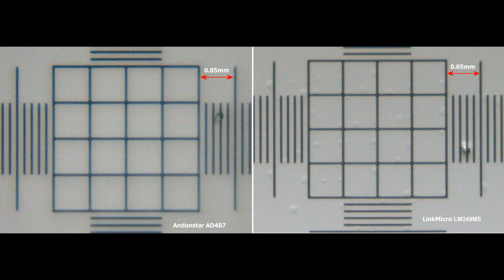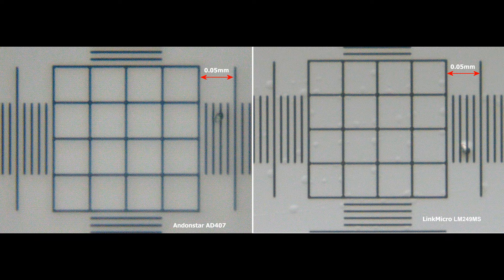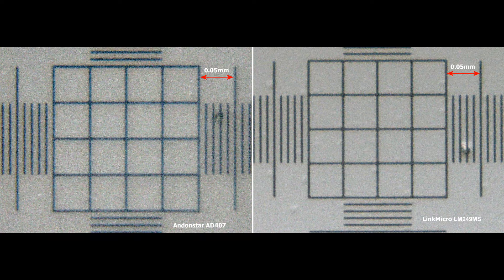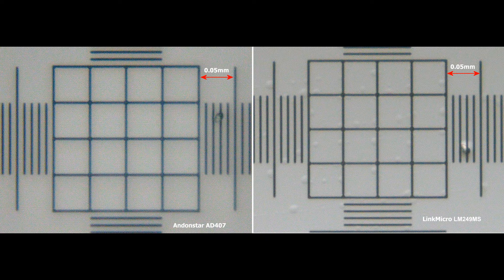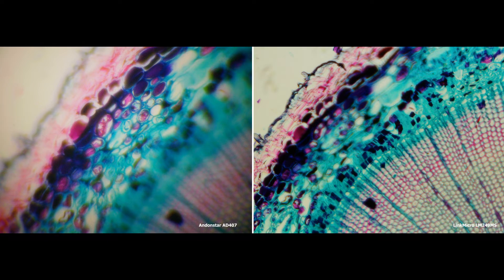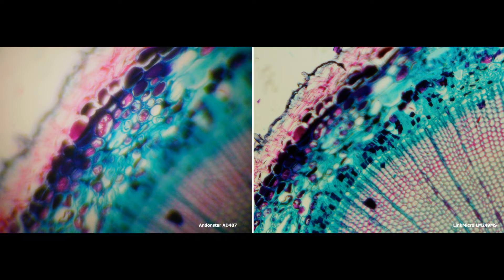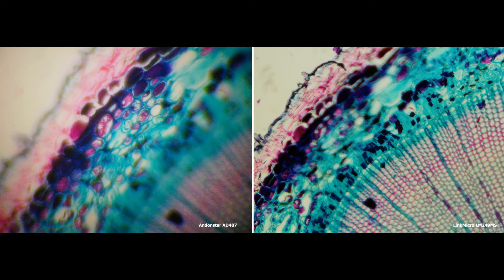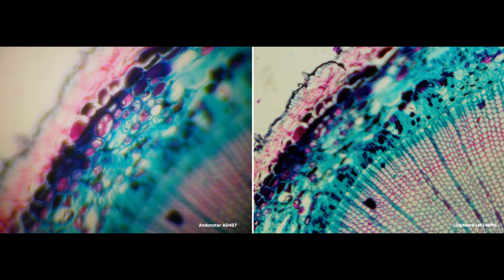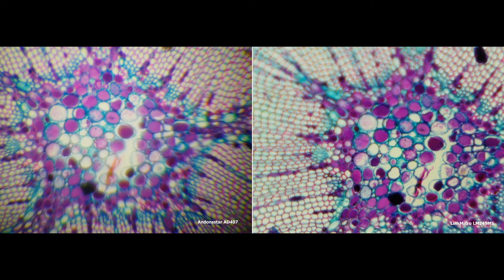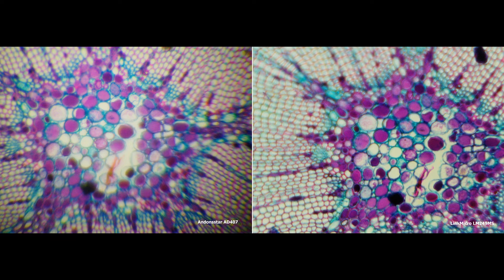Despite the cheap construction of the lenses, they perform quite well. The images are at least as good, if not better, than that of the Andonstar with the extra lenses I tinkered together myself. This shot is of a pine stem. I think it's very beautiful. It is one of the five beautiful slides that come with the microscope.